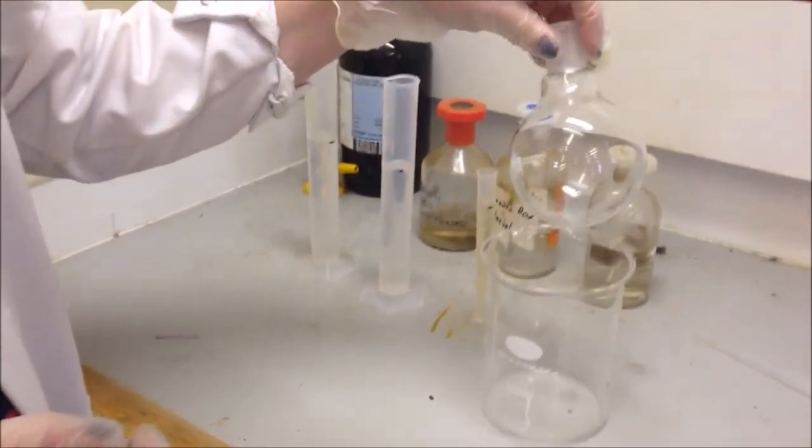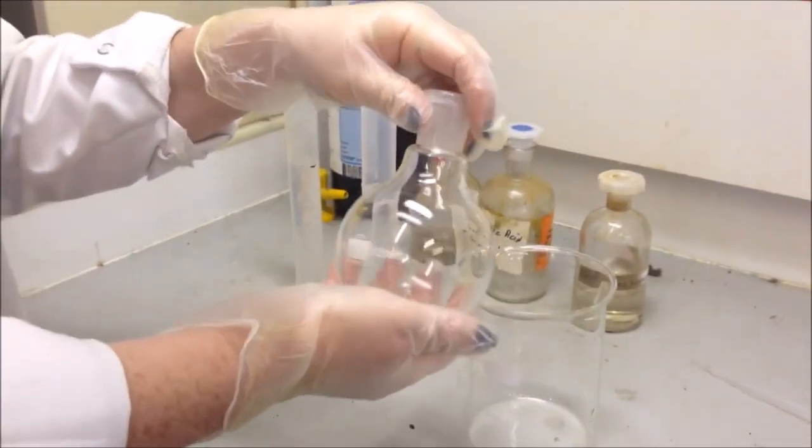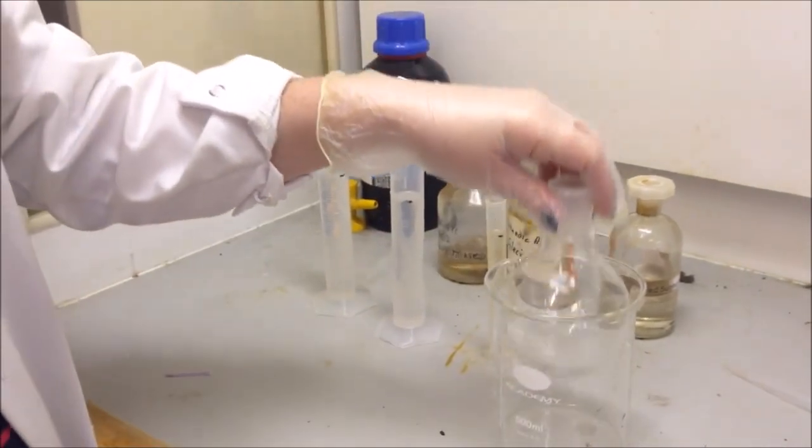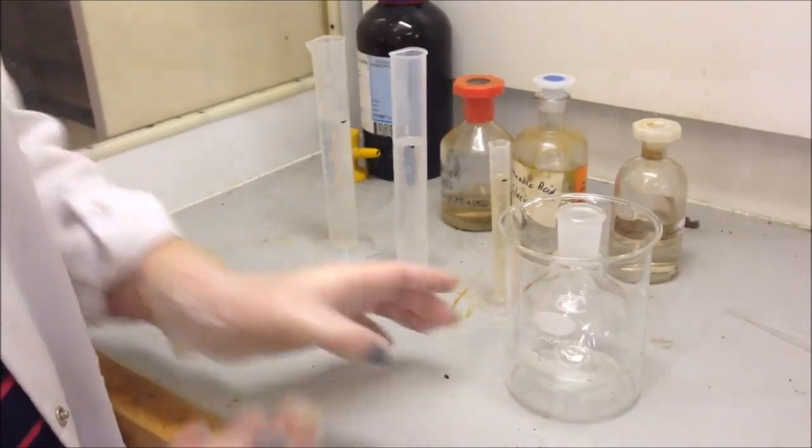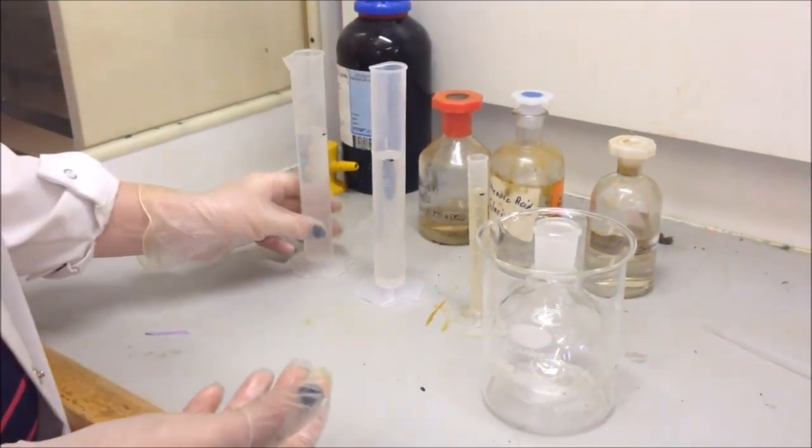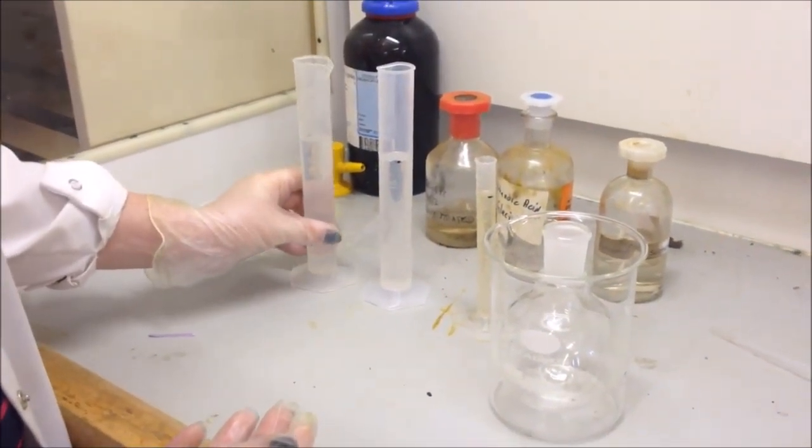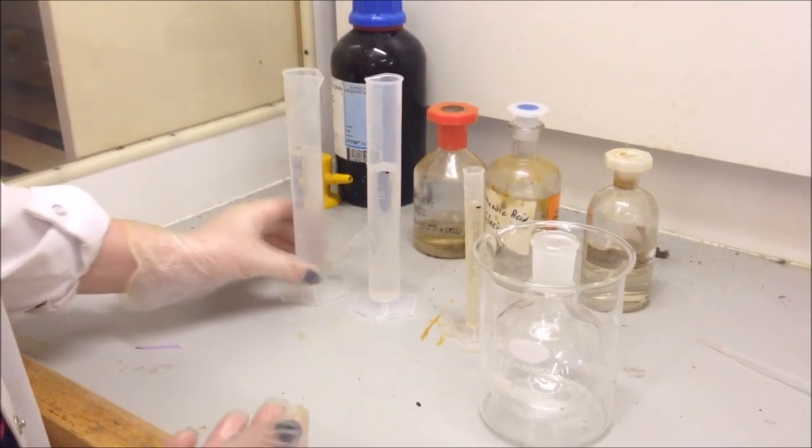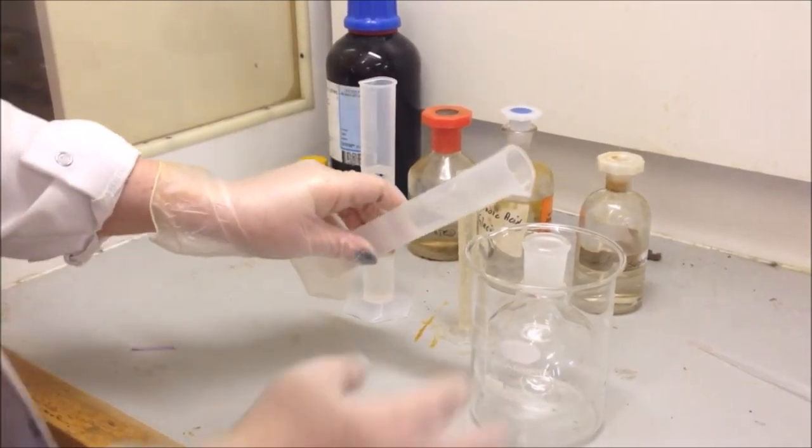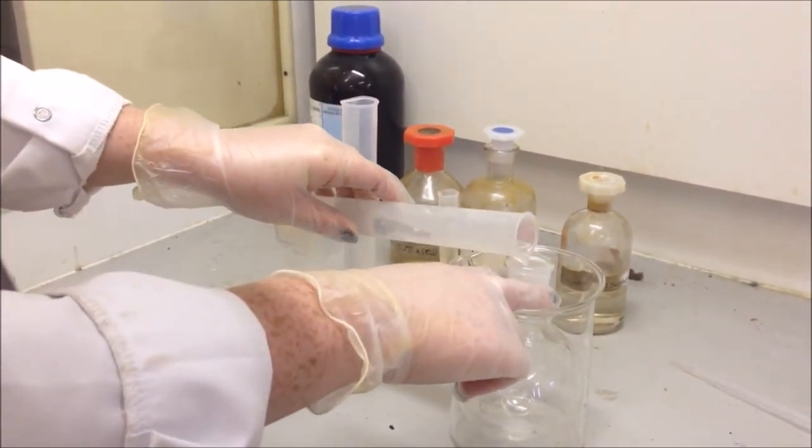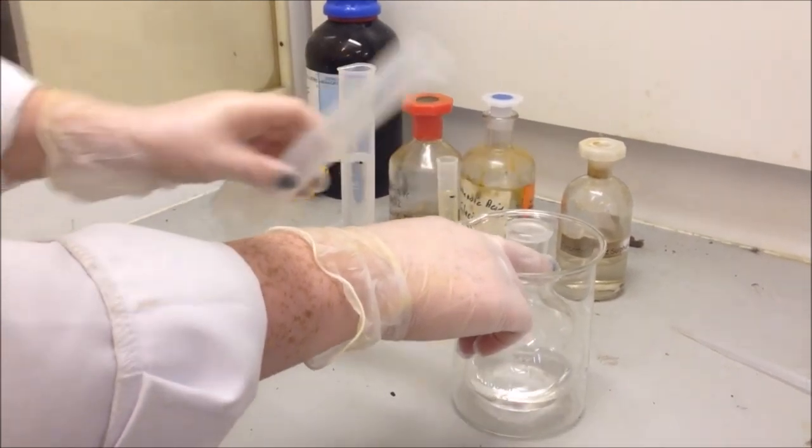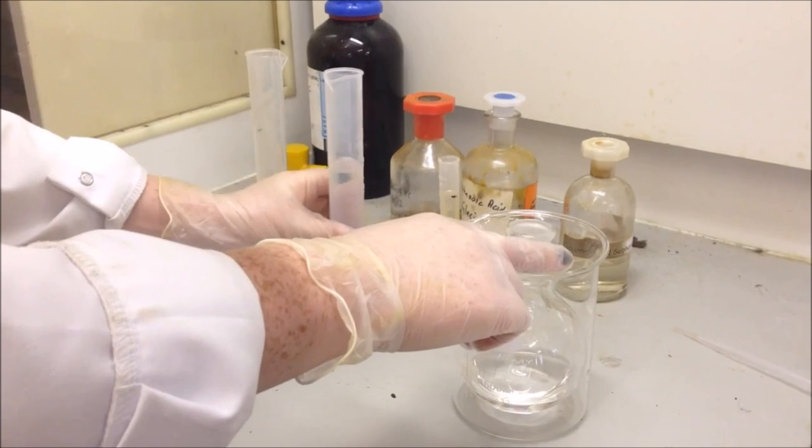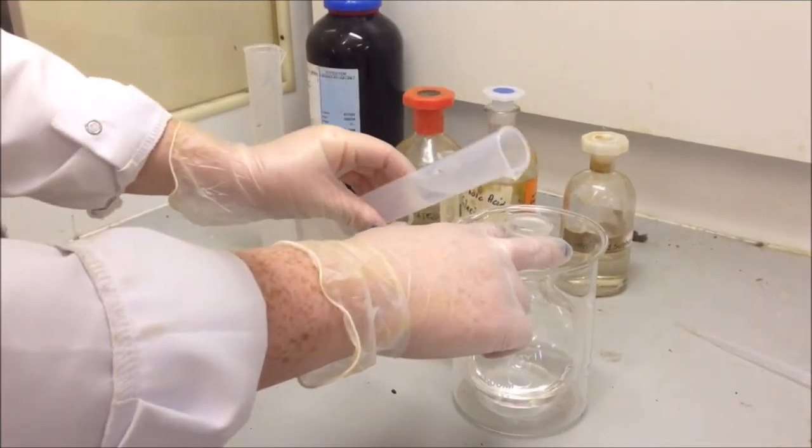Here we're going to be using a round bottom flask. Obviously these are round, so to hold that steady I'm just going to put it in a large beaker to hold it as a secure base. We are going to make an organic solvent, so I have 50 cm³ of ethanol and 50 cm³ of glacial ethanoic acid.